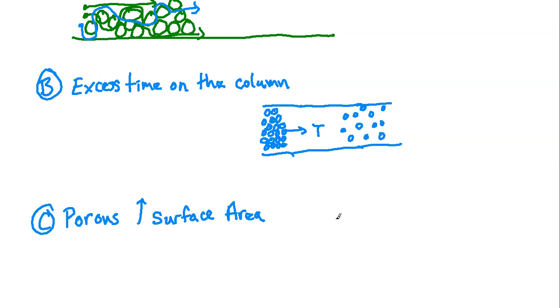And so a lot of the images that you'll see that kind of set this up, it almost looks like a Pac-Man image, okay? But you've got sort of this bead here that's got the pores in it, all right? And then these are the modifications. If you look at these little hair-like structures, right? These are your C18s or whatever coming off here. And so what you want to kind of keep in mind, and let's bring this actually all the way up here, okay? That'll work better for the example. What you're going to see here is that if your analyte is sort of coming across as a band here, right?